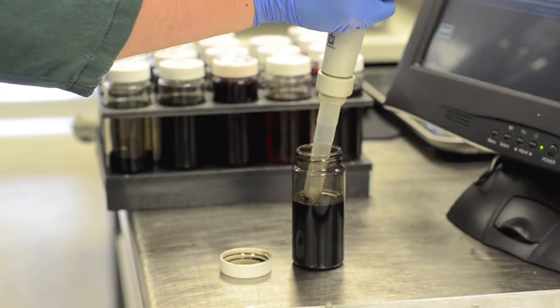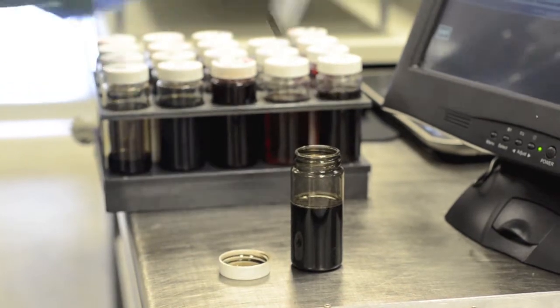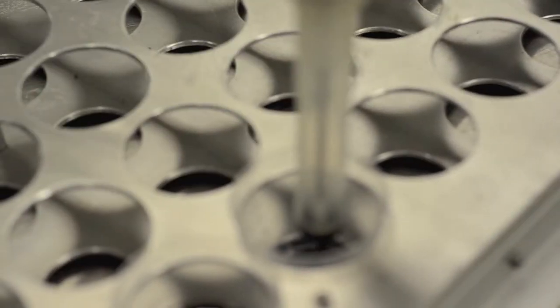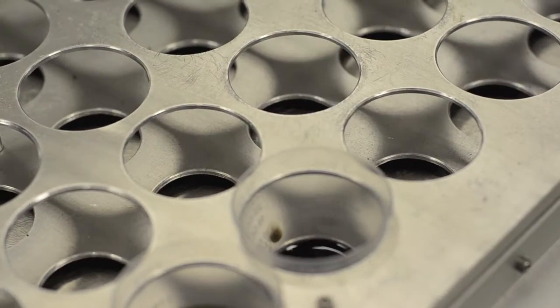For samples with extreme amounts of contamination, a single channel pipetter can be used to accurately dispense as little as one half of a milliliter of sample to produce a dilution ratio of 60 to 1.